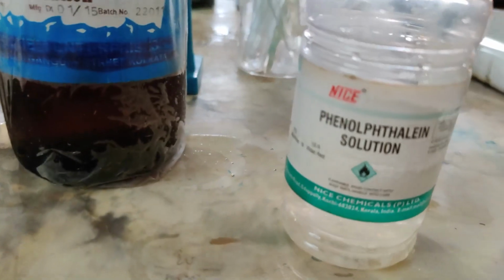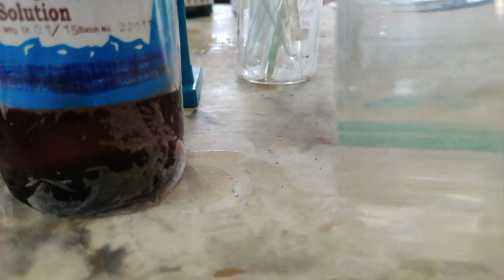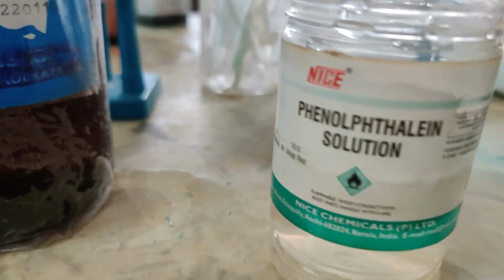Then the next common indicator is phenolphthalein solution. Here phenolphthalein solution is a colorless solution. You can see a colorless solution inside the bottle, and you know it will change to a particular color as we discuss.